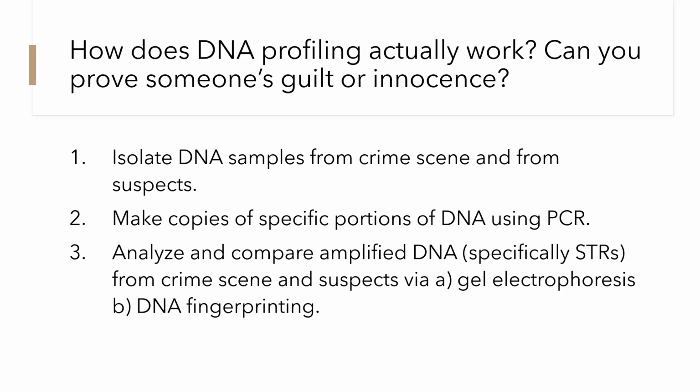A lot of times in crime scene TV shows, they'll collect something at the scene. So you might collect something like blood or saliva. But sometimes they also invite suspects out to have a coffee, and then they take their coffee cup right at the end of the scene, and they're like, aha, I've got some DNA. That's actually all pretty viable because you can isolate DNA from things like saliva.